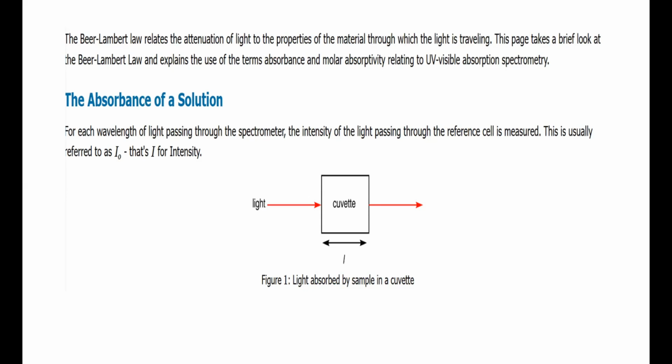They are arranged in a particular fashion. So that molecular arrangement is going to be responsible for absorption of light and also for which wavelength it will absorb, which will vary if you compare the same property with some other solution, say copper sulfate.